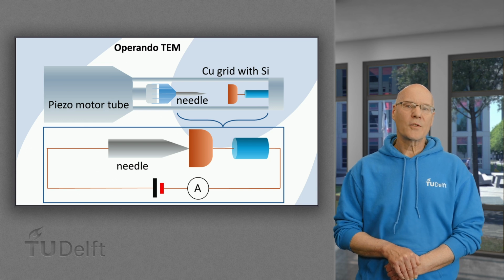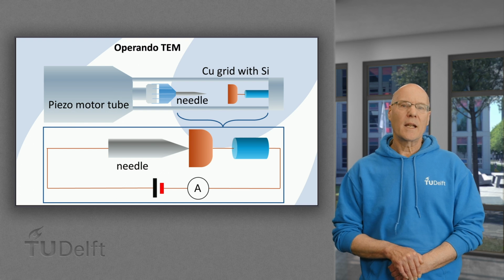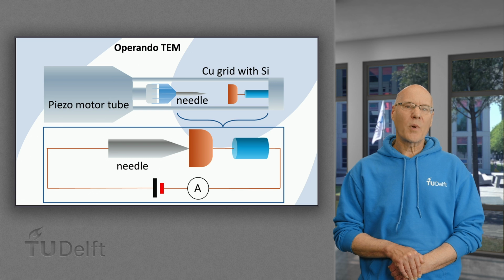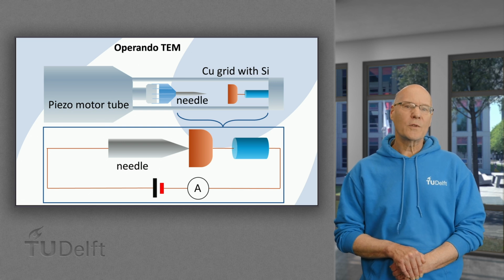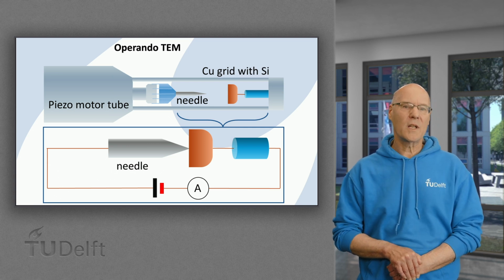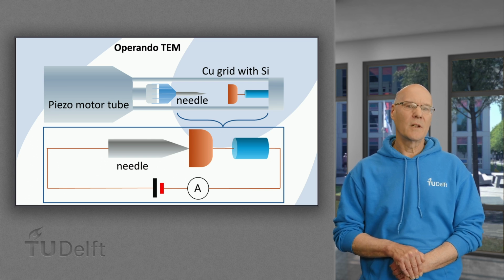But one of the concerns for a solid-state cell is the contact between electrolyte and electrode. So when using silicon nanoparticles, it would be useful to study the point contact with the solid electrolyte, especially since silicon may lose its contact with the electrolyte due to its volume changes.